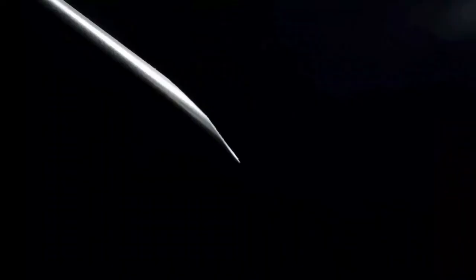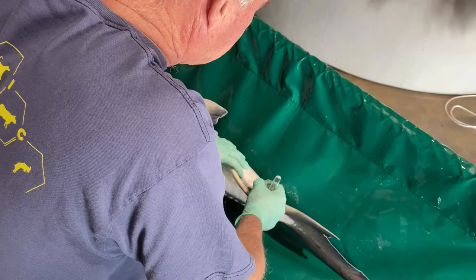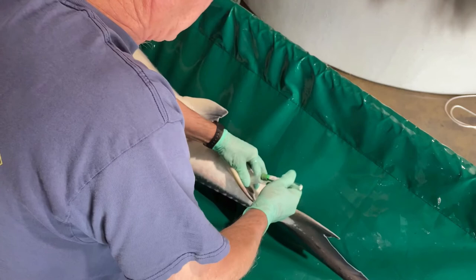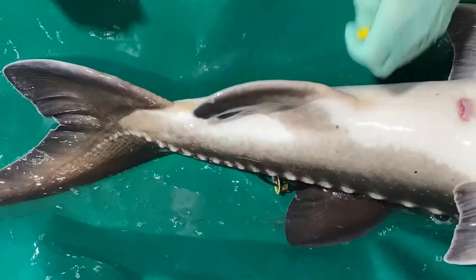Before we insert the needle, it is important to position the bevel edge of the needle towards the head of the fish. With the sturgeon lying on its back, the syringe is inserted just behind the anal fin until a slight resistance is felt. This resistance is the cartilaginous sheath that protects the caudal vasculature.